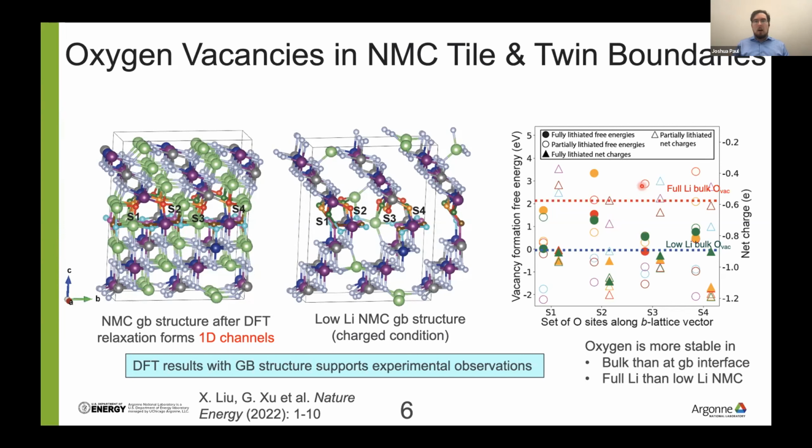So this is an example of Ingrained STEM being used in order to further investigate an experimental system and provide an explanation for an experimentally observed phenomenon. Now, the experimentalists can work to try and minimize the presence of these grain boundaries in order to prevent this oxygen evolution from occurring. So, successful application of Ingrained.